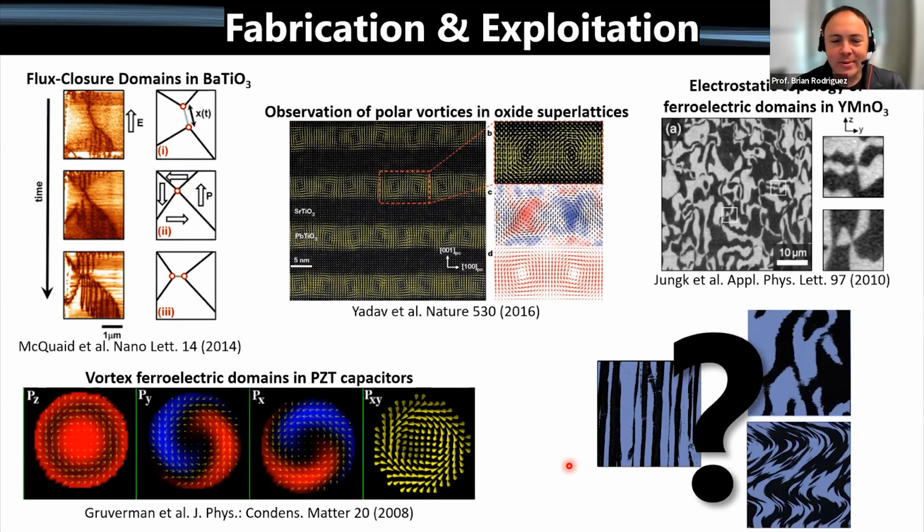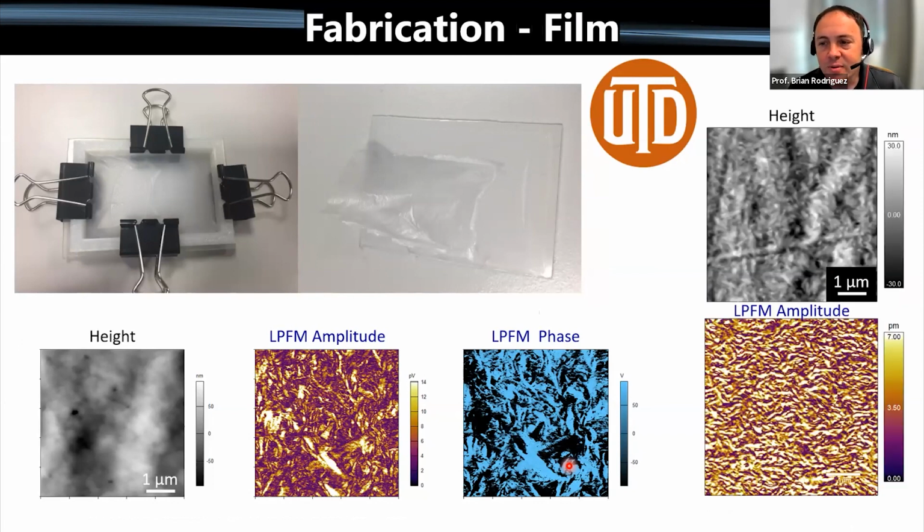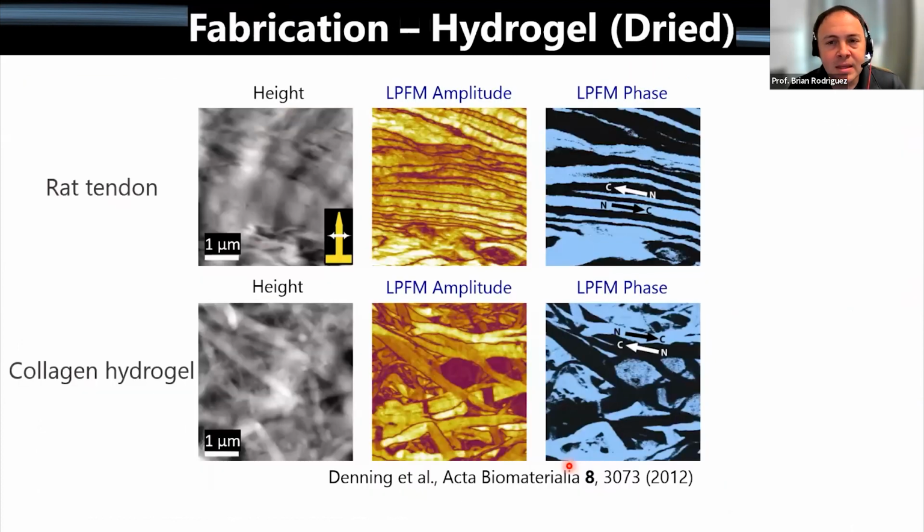I mean, ideally, what we would have is have all the collagen, the polar direction aligned in one direction, and that might give us an enhanced electromechanical coupling for energy harvesting. So we tried a number of different ways of preparing collagen. This is collagen that's not forming fibrils. It's just kind of a gel that's then dried. We can see the response. There's some clustering and ordering, maybe under an electric field or something. We could control this a little bit more. So we get this kind of structure.